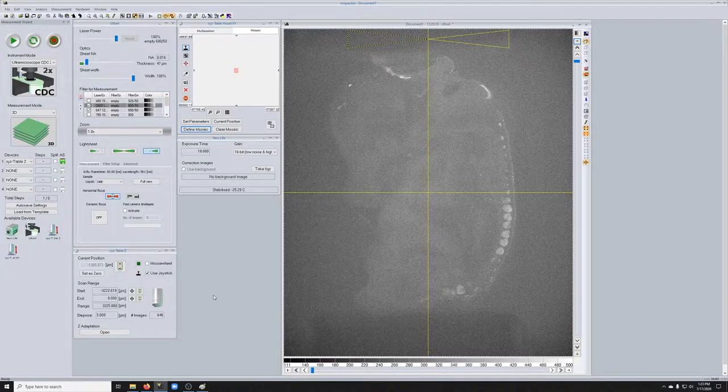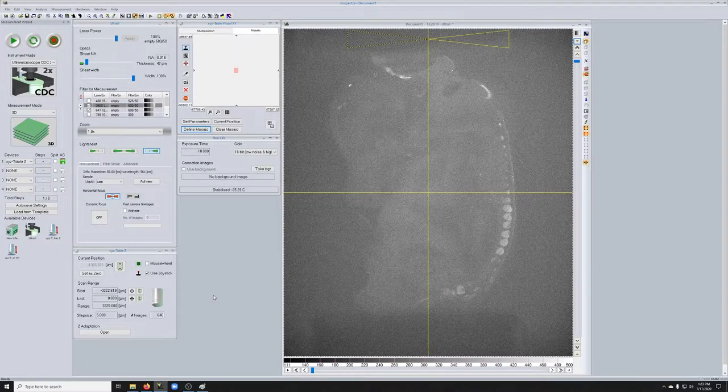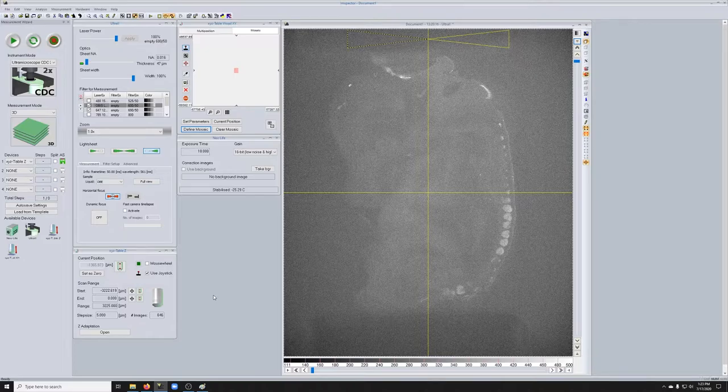Let's discuss how to do cropping. Cropping is very useful in cases where the sample doesn't fill the full field of view or in cases where you need to do tiling.